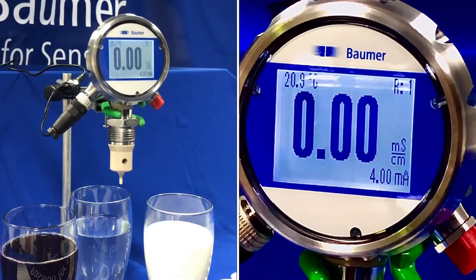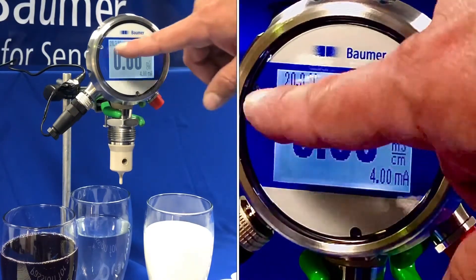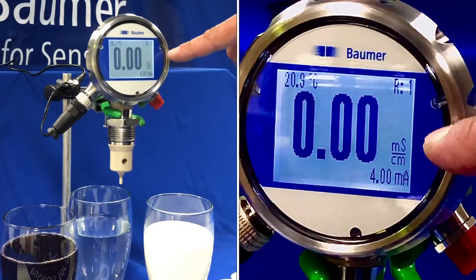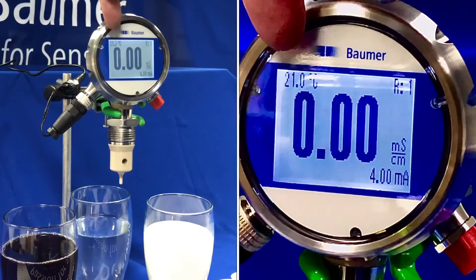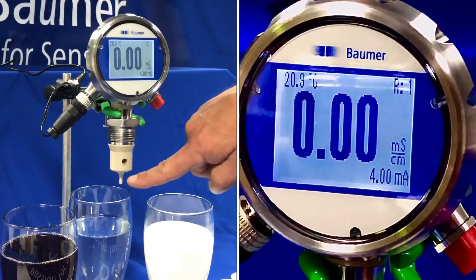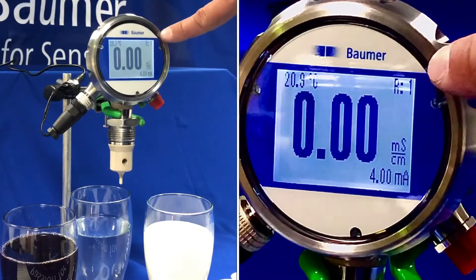Here's the test we're going to perform. I've got three types of media to look at. On the DFON display I'm showing the millisiemens per centimetre reading in the large letters, the temperature taken from the PT100 probe at the bottom of the sensor tip, and also the relay status.